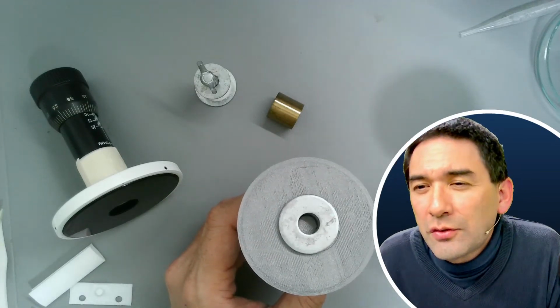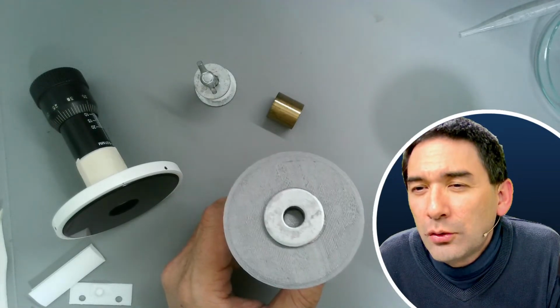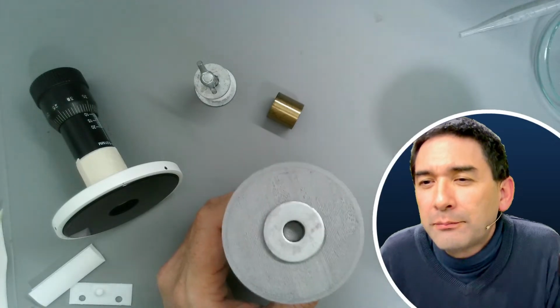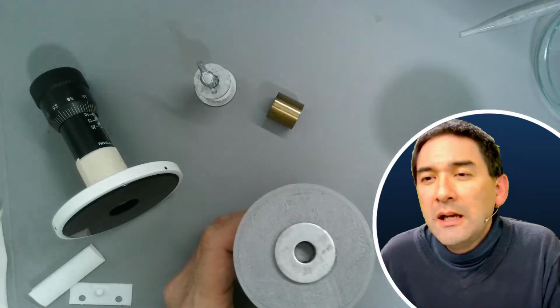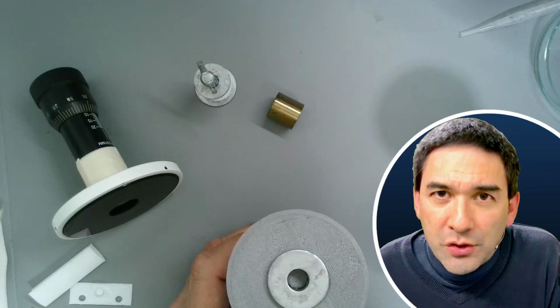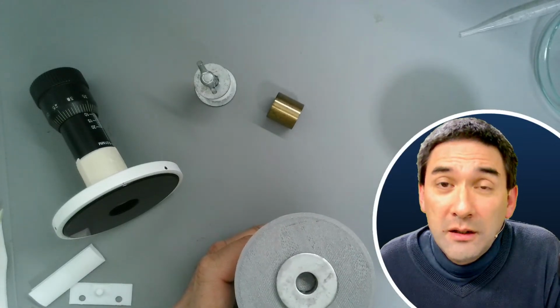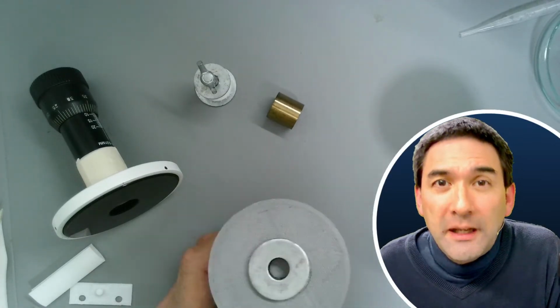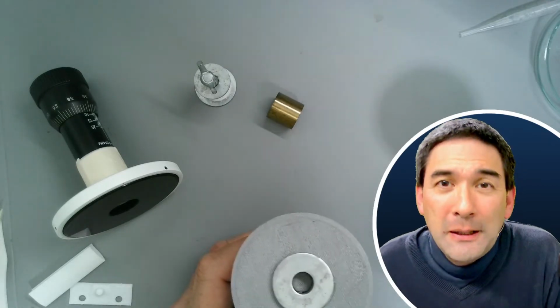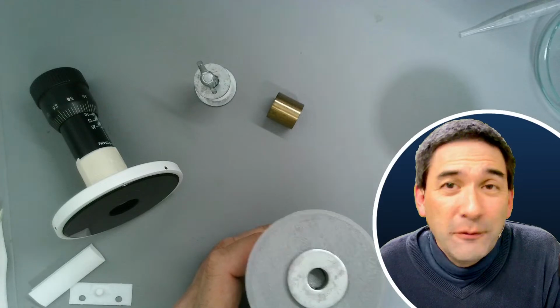There's another question here. Do you store your microscope optics in a special humidity controlled environment? I'm probably overly cautious, and I try to keep it around 55 percent humidity at all times. The short answer is, and that's an important question really, so basically, how should you store your microscopes? I do not store them in a humidity controlled environment because in the place where I'm living, it's not necessary. I'm living in Central Europe, so it's different than in the tropics.